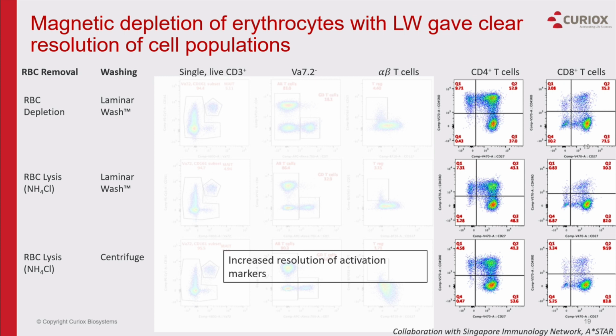And this is not unusual. Different cell types will become more fragile than others in memory cells, but this becomes very important in our experiments, especially if we're looking at a polyfunctional immune response, either in cell therapy, immuno-oncology, or these days they're becoming a target for COVID samples as well.